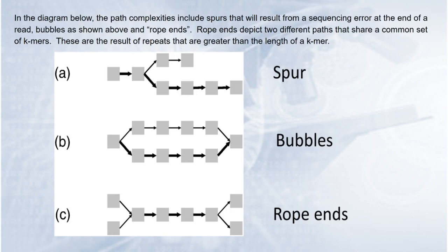In the bottom one, it's kind of the opposite, where we're starting with two paths. So two contigs that are being formed. And yet in the middle, they join and become one and then separate again. And so what most likely gives rise to a pattern here, which is very difficult to deal with, is you can be making a contig from one part of a genome and a contig from another part of a genome and having unique paths that are taking place there.